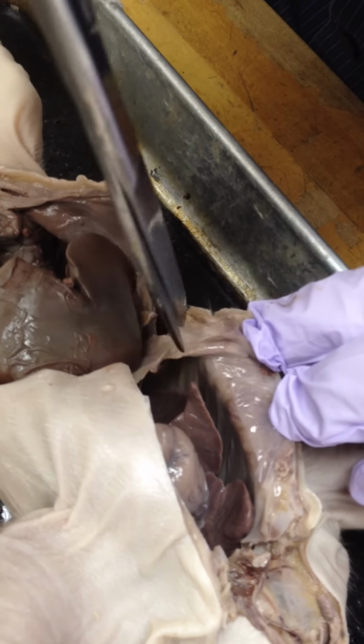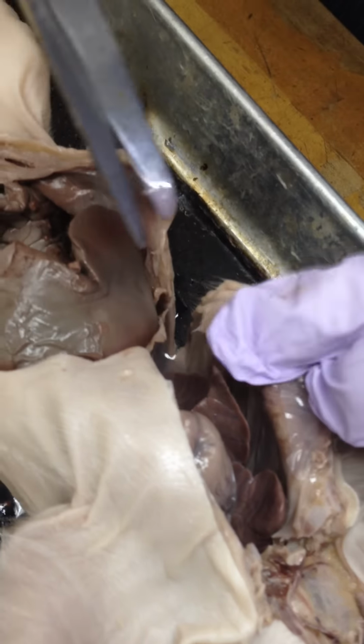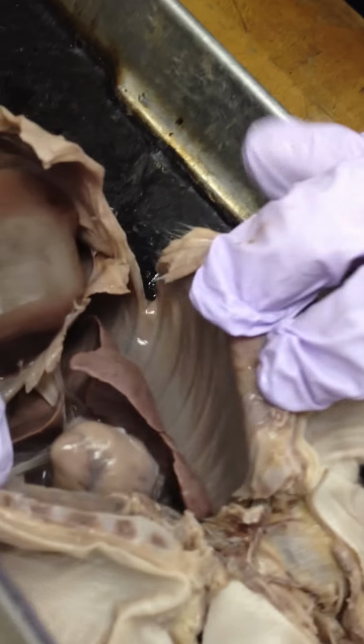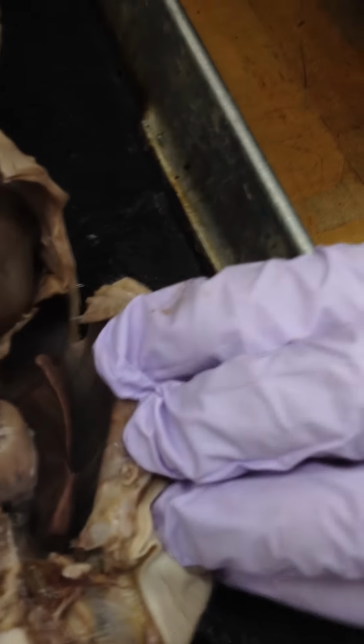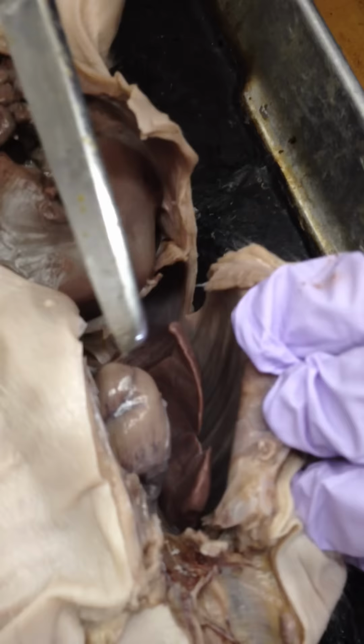Here we go. Kidney, you mean? Or no, to cut the... Oh, here we go. There's the lungs. We're on the lungs, and there's the heart in the middle. Heart and lungs and heart. Okay. Exciting.